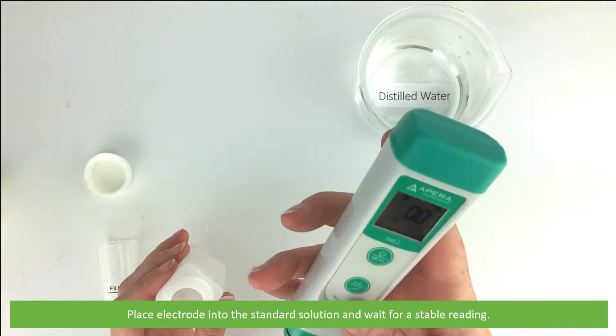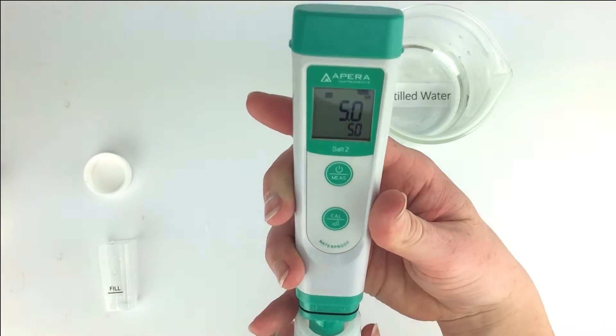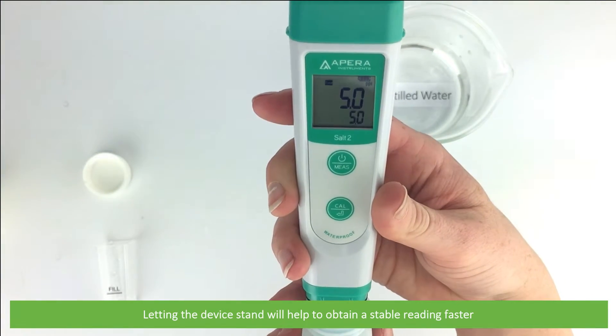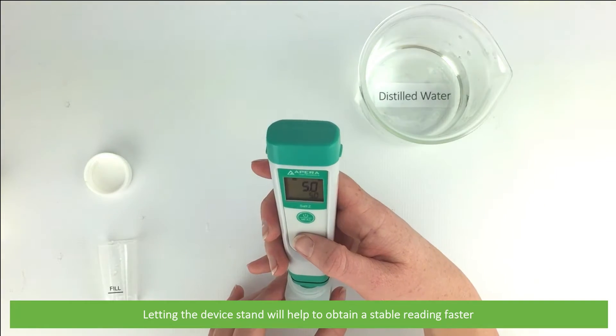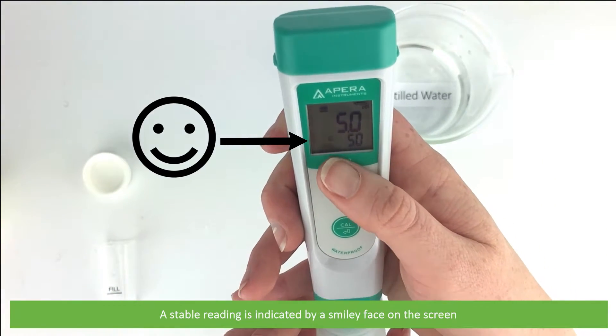Place the electrode into the standard solution and wait for a stable reading. Leaving the device to free stand will help obtain a stable reading faster. A stable reading is indicated by a smiley face on the screen.